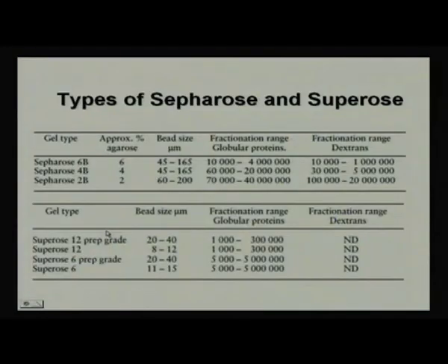In this way we are selecting, and these are all standardized matrix molecules available in today's market. So these are some of the matrix molecules.